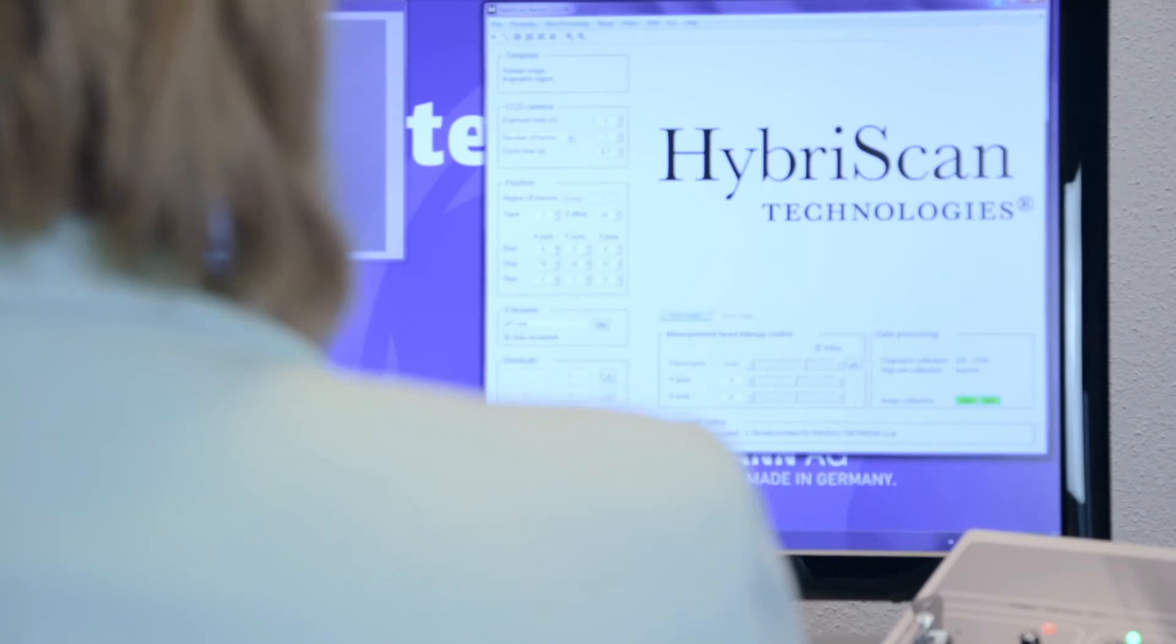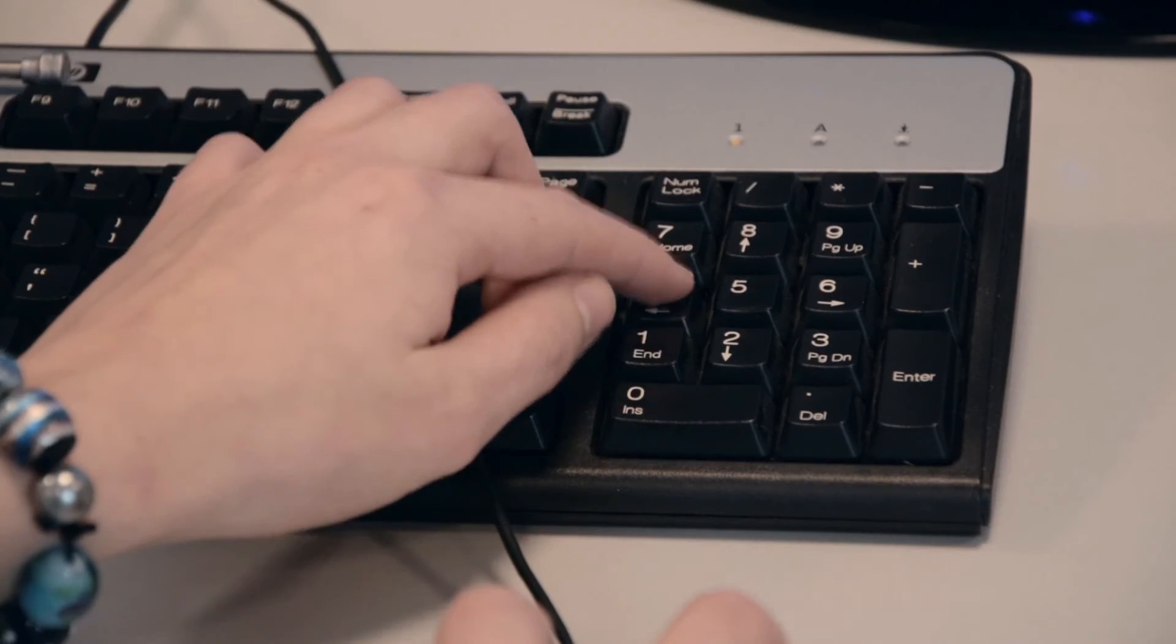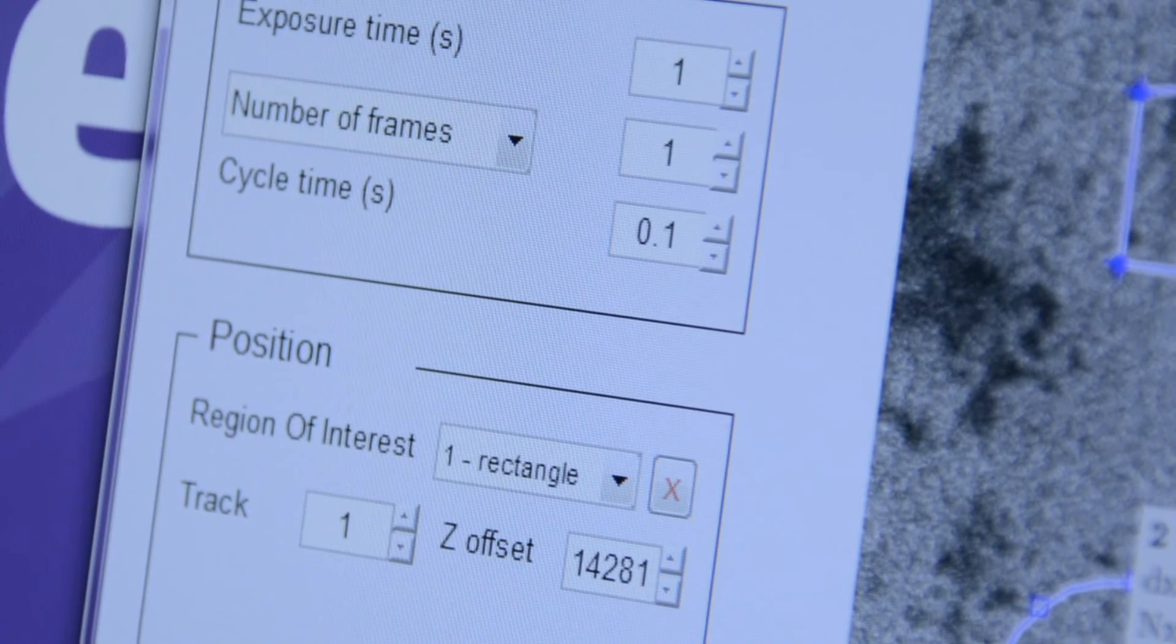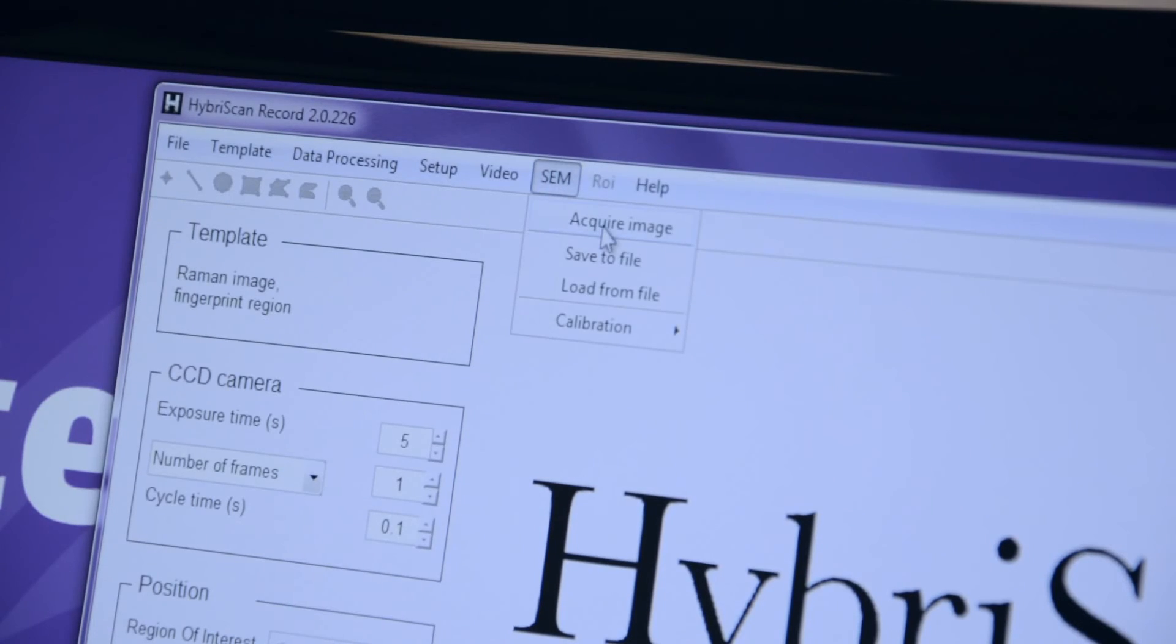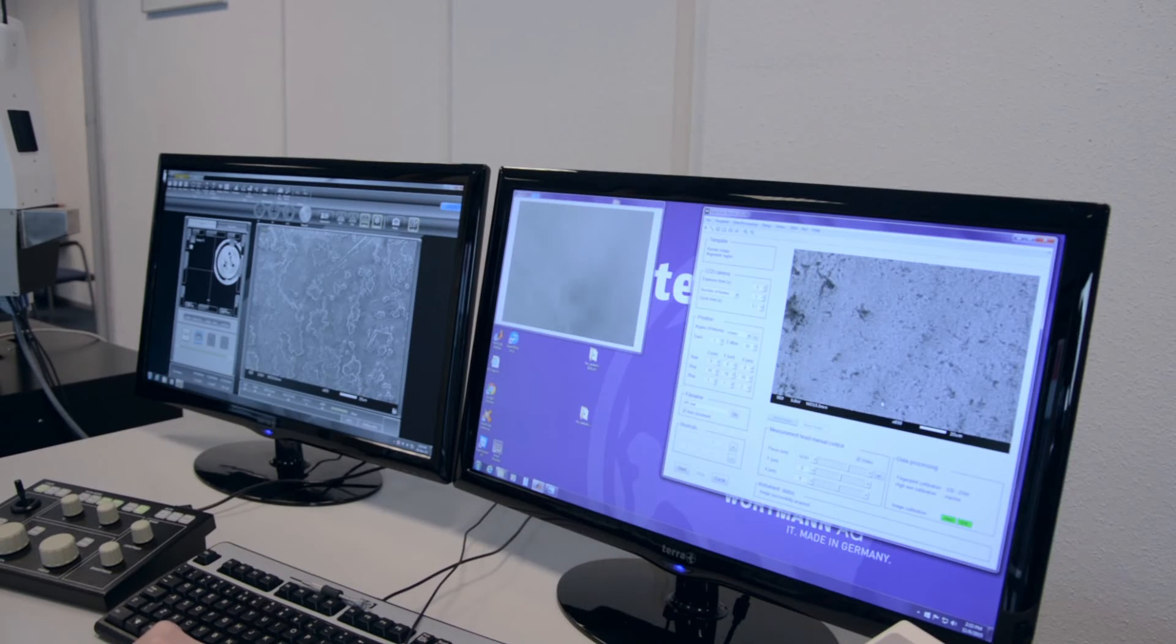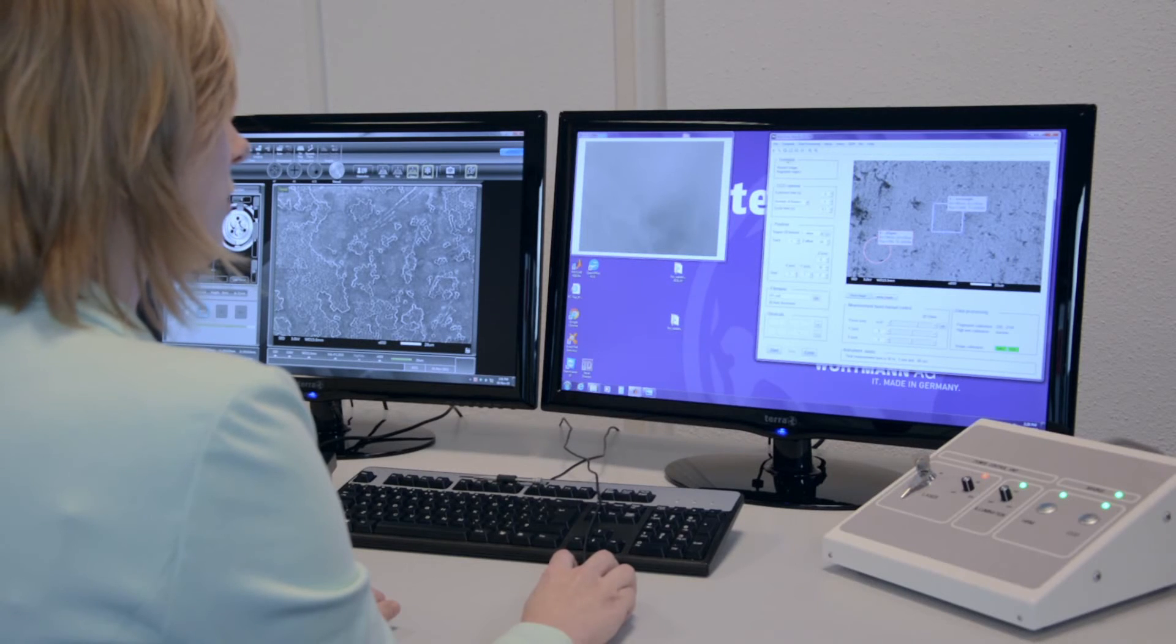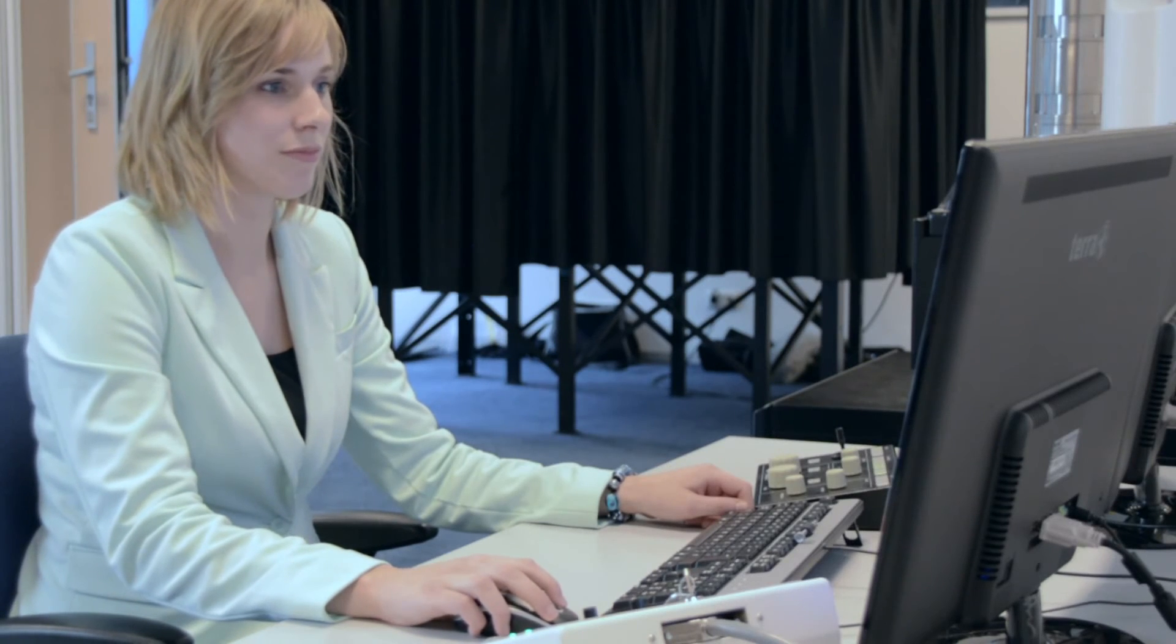The Raman spectrometer is controlled from the Hyberscan Record user interface. All settings for spectroscopy and Raman imaging can be adjusted there. In the Hyberscan Record program, any previously acquired SEM image can be loaded. Regions of interest for Raman imaging can be selected in this SEM image. The menu enables selection of different shapes and multiple regions of interest with user-defined sizes.